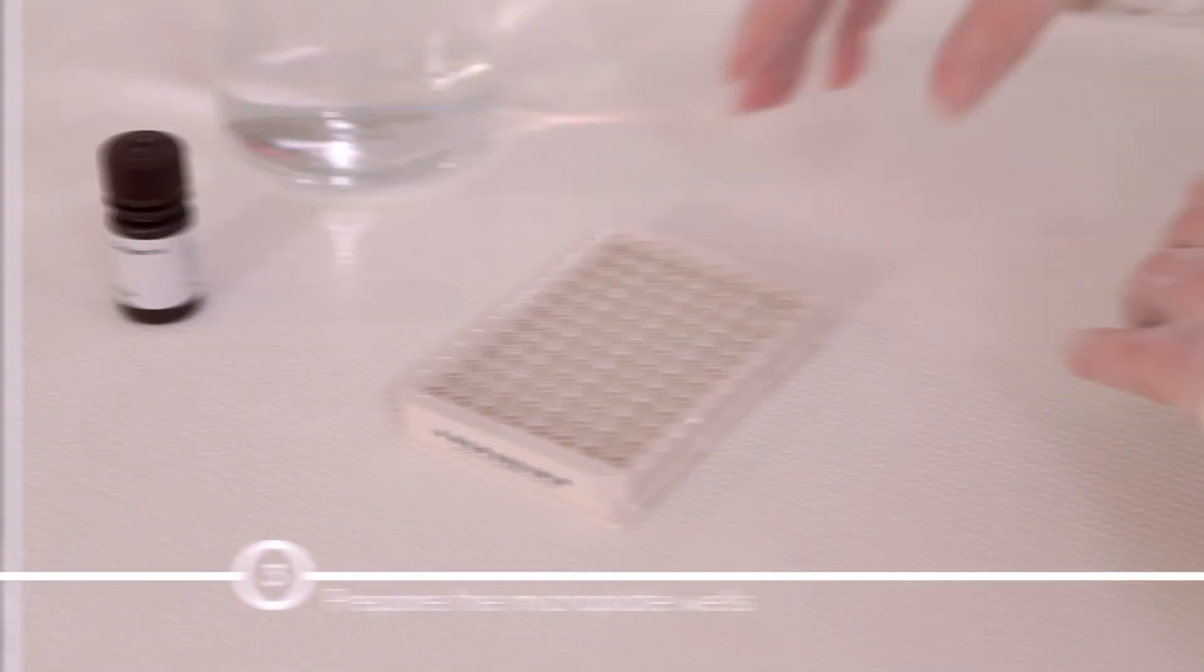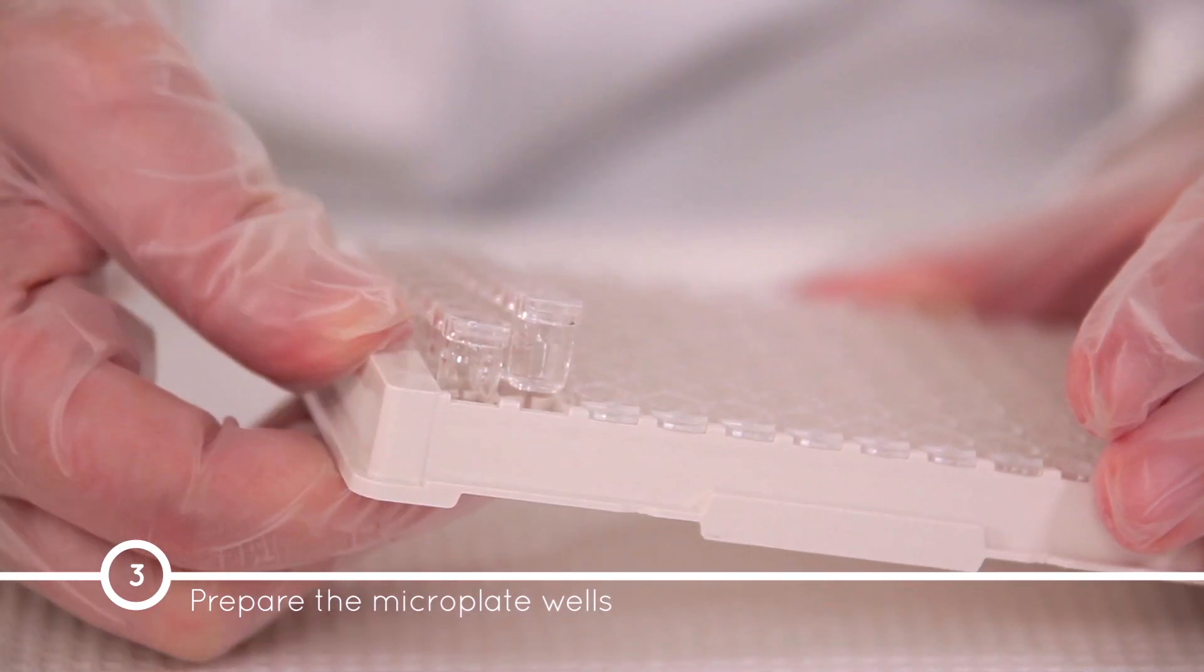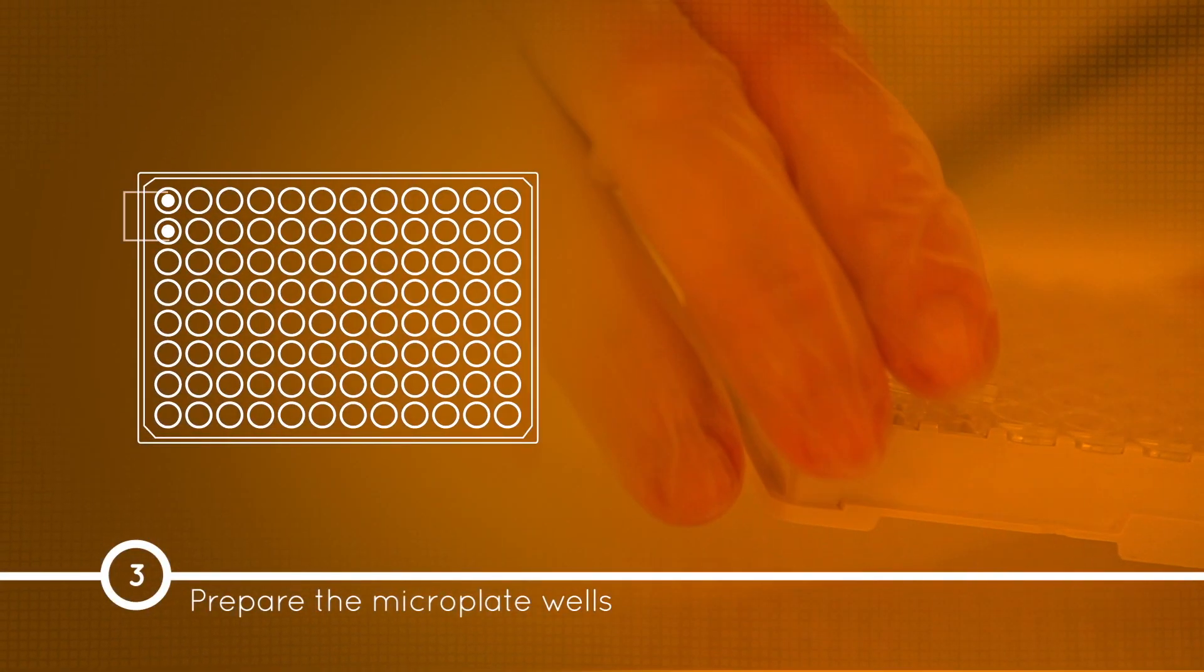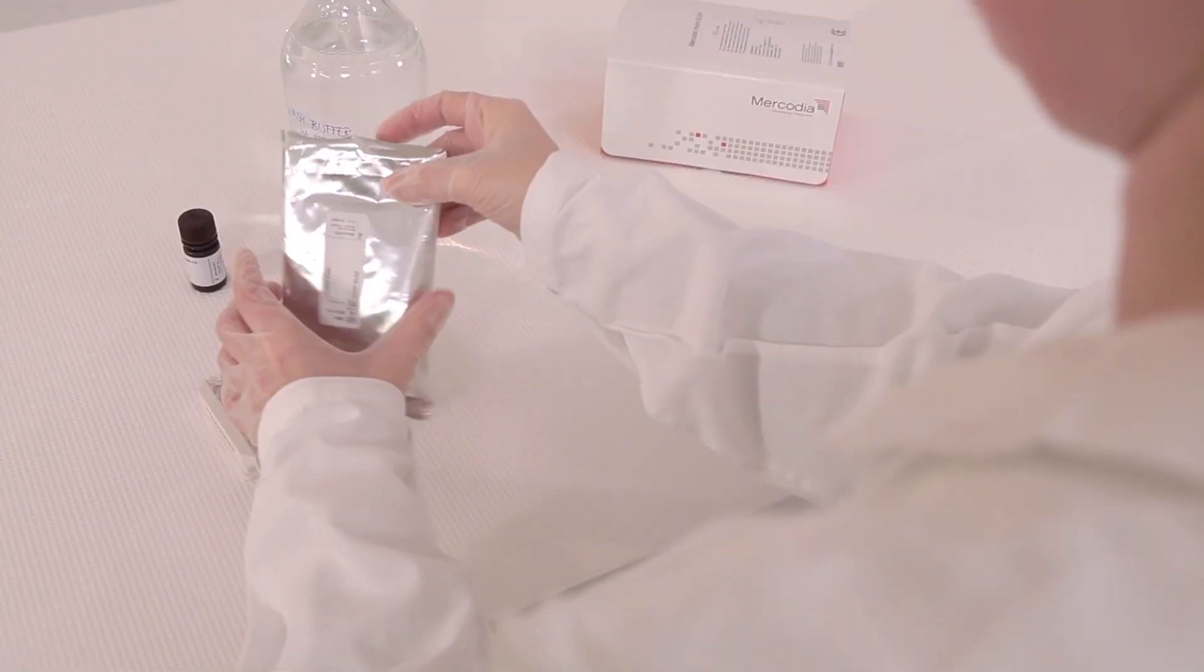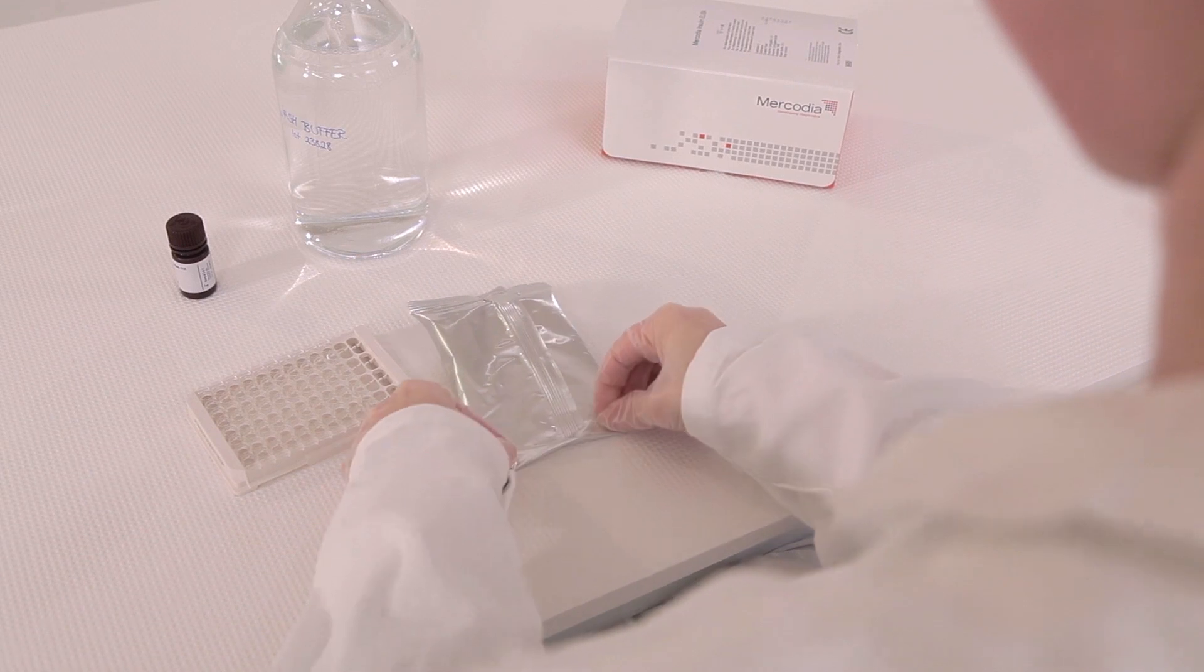Prepare the microplate wells to accommodate calibrators, Mercodia antigen controls, and samples in duplicate. Unused strips can be removed and stored in a sealed bag for two months.